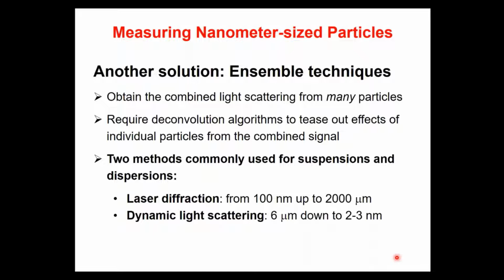And of course, ensemble techniques are represented in the laboratories currently by laser diffraction and dynamic light scattering.